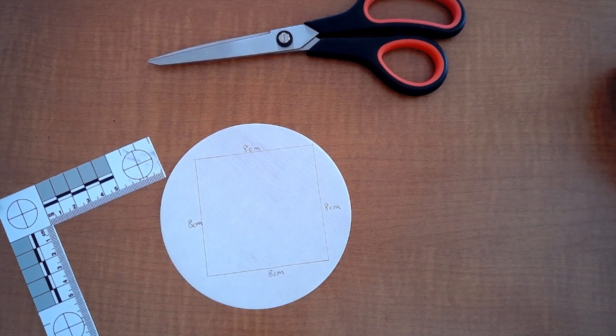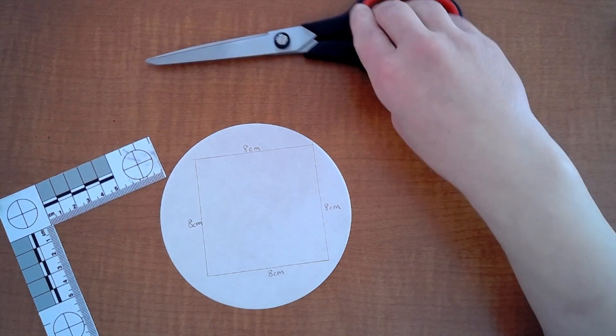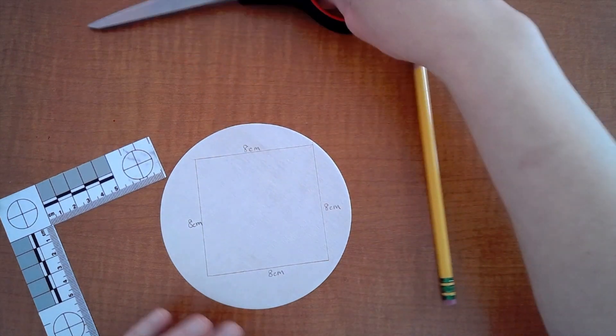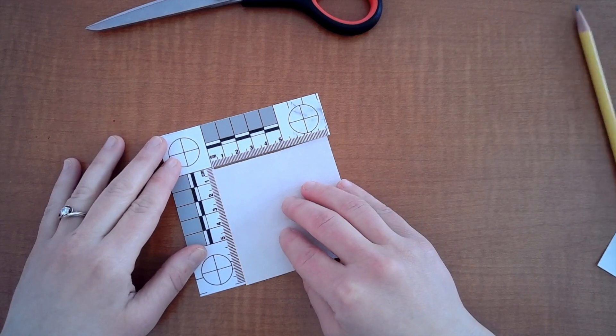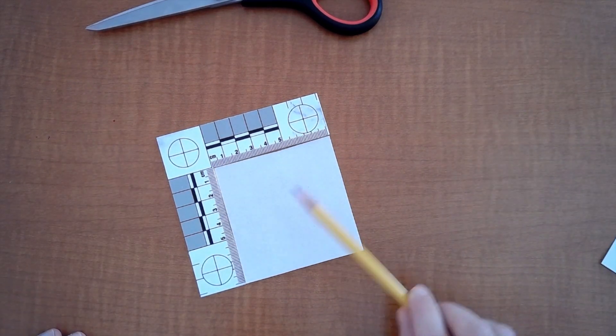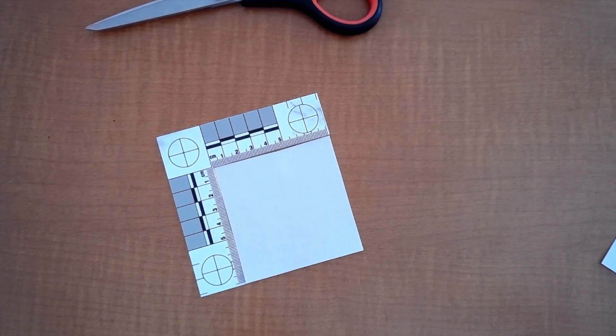Once you get your eight centimeter by eight centimeter square you're going to use your scissors and cut it out. And as you can see I have already done that and look it should fit perfectly. Eight centimeters by eight centimeters.